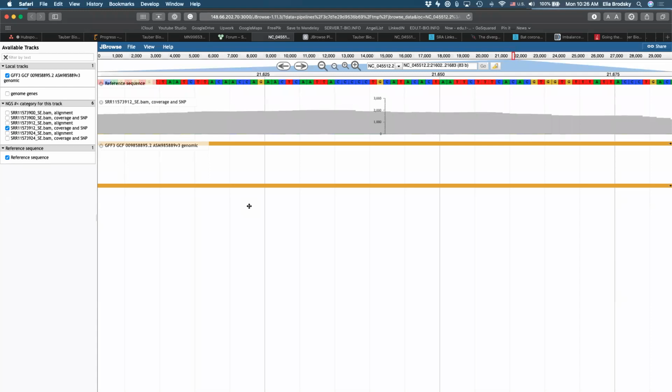2,000, exactly. So a lot of reads, right? Compared to, for example, your standard amplicon sequencing or something like that, this is a lot of reads. And this is across 30,000 nucleotides, right? So it's a fairly long genome. And so you really have thousands and thousands of reads across this whole genome. In fact, if you did get this result and you scroll all the way to the end here, you'll see that there's over 50,000 reads towards the end, okay?